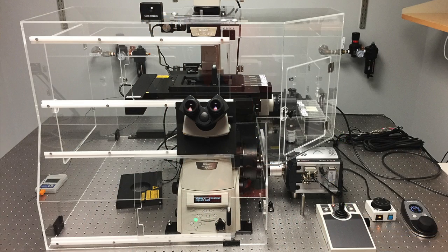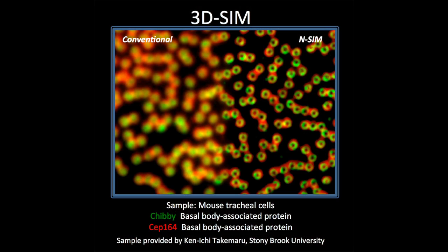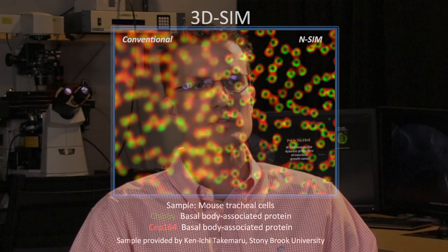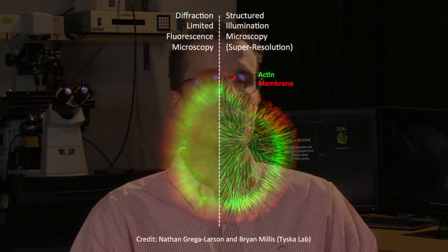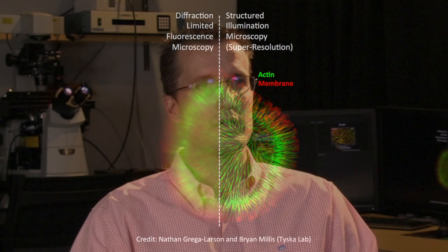We actually feature 2 super resolution microscopes within the Center of Excellence. The first being a structured illumination microscope, which is very exciting because super resolution has been a buzzword in the last few years, and its development continues. With SIM, we can answer both live as well as static questions, meaning the cells are fixed or they can be live on this particular microscope. And we can answer a whole host of questions with the ability to resolve structures at twice the resolution limit that we can traditionally get from confocal or wide field technologies.